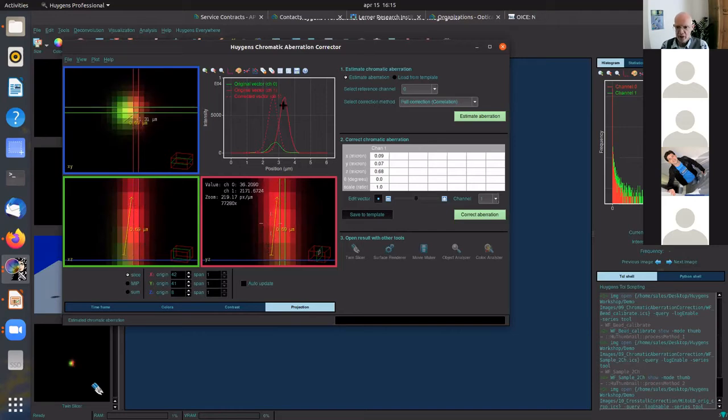And here there is a graph showing the shift in the alignment along the vector. And here there is a slider, and we can even adjust this. So this is the default, the old position, 0, 0, 0, and you see that the peak shifts in the graph.